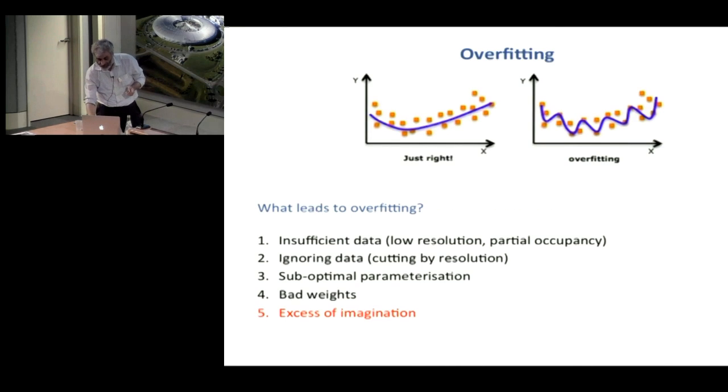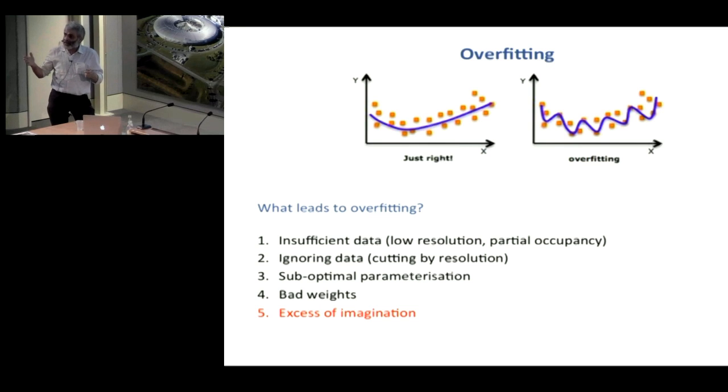The next topic I'll just mention is overfitting. Overfitting has many different interpretations, and the main interpretation I like is that you increase the number of parameters so much that... okay, I'll rewind back. When you have data, you have a signal and you have noise.